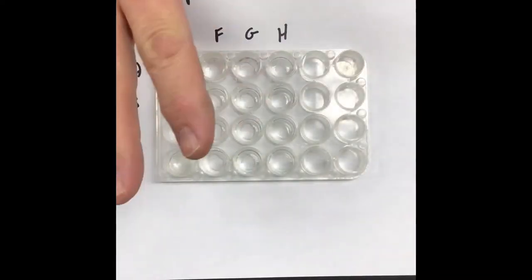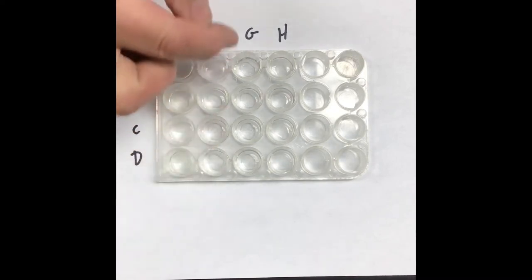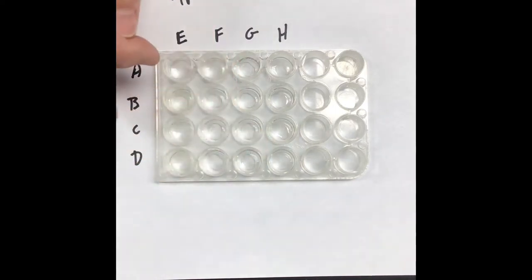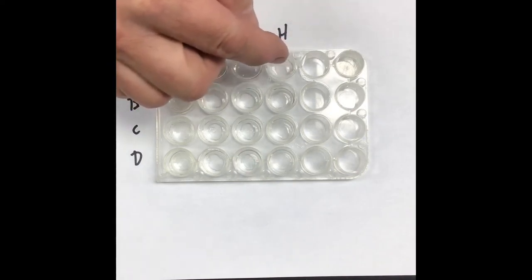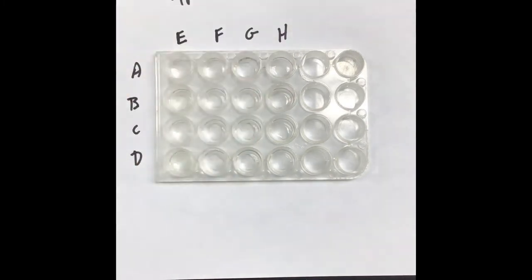Okay, guys, so here's our setup. I have added 10 drops of compound in column E, column F, column G, and column H. Each of these has 10 drops. What I'm going to do is add unknown A all the way across here, 10 drops in each one of these, and we'll take a look at it. I'm going to do the same thing with B, C, and D, and see if we can figure out which ones are acids or bases.